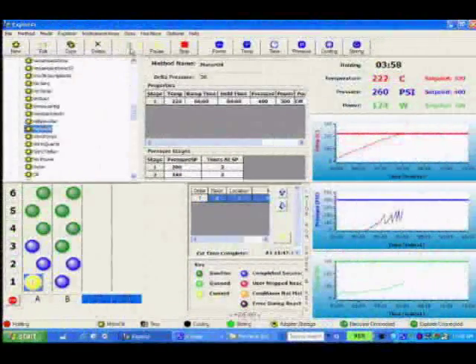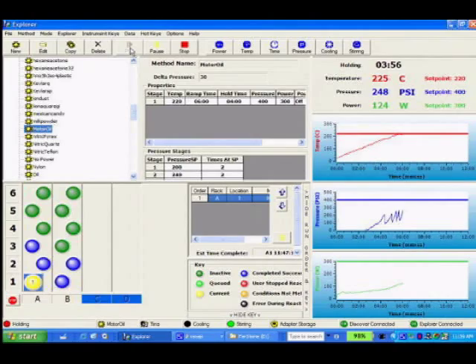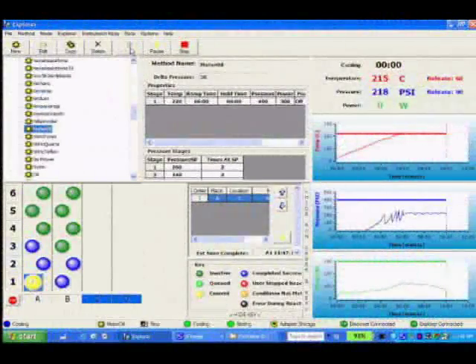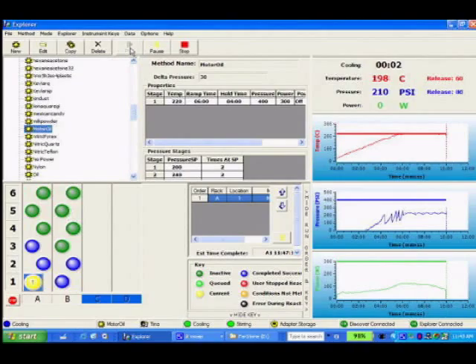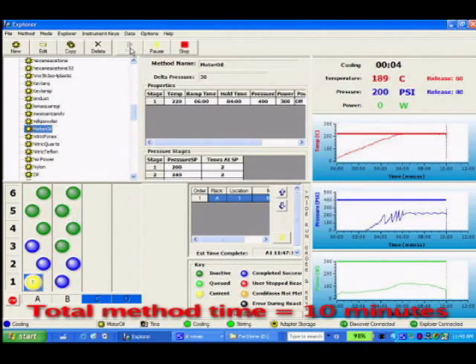While the digestion temperature is held, CEM's patent-pending Activent technology safely vents away any excess gaseous byproducts at user-defined pressures if necessary.